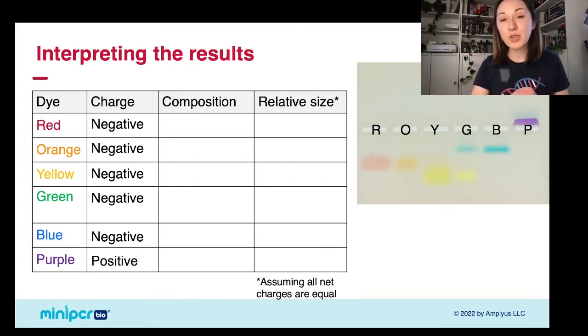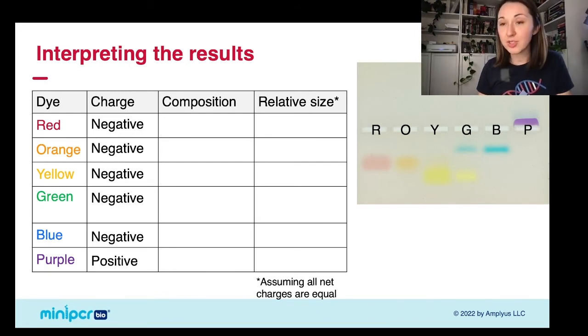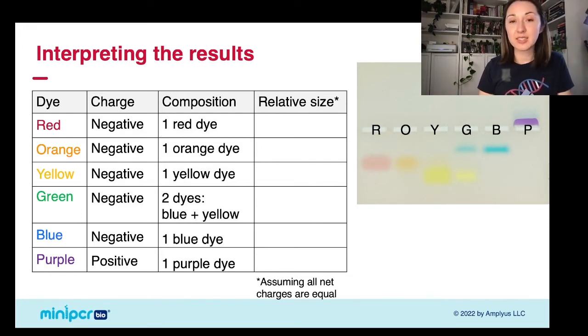The next thing that we can look at is composition. Again, red, orange, yellow, blue, and purple all have just one band, so they must have been made up of just one type of molecule. But our green lane is actually made up of two bands. You can see it's made up of a blue dye and a yellow dye. So our green has two dyes, whereas all the rest of them just have one dye.